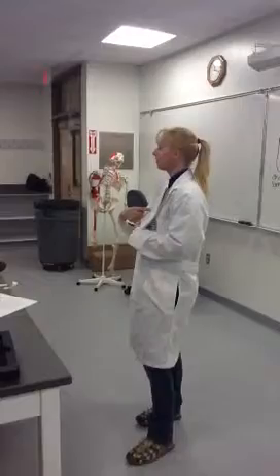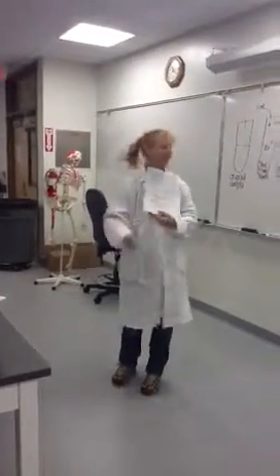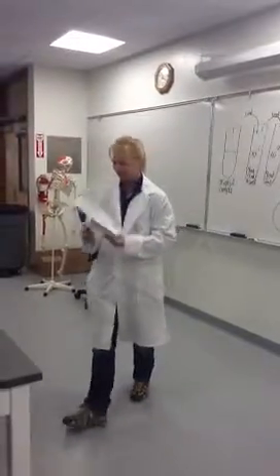So if you're doing this and it seems like, well, that's too simple, it is too simple. The idea is that you get the theory of this, because in reality, if you were having to count organisms in a lab, there are electronic methods of doing this, that if that's what you did all day long, they wouldn't pay a person hourly to do this anymore. They would buy the equipment and do it electronically. This is to give you the theory behind it, so that's why we use nice, pretty numbers like that.